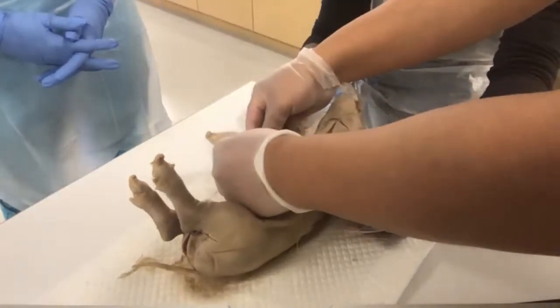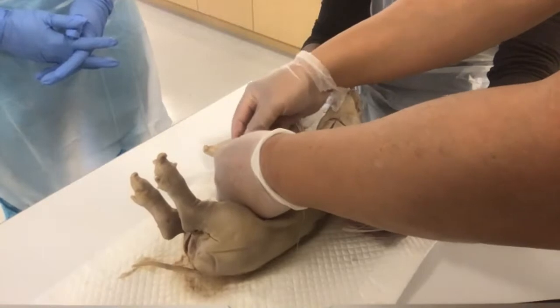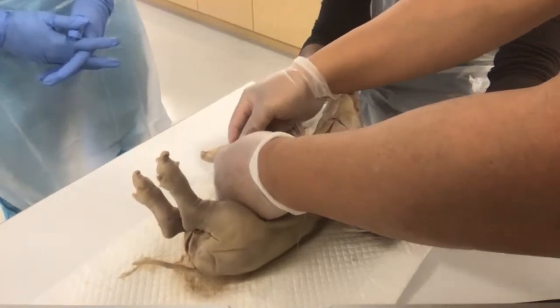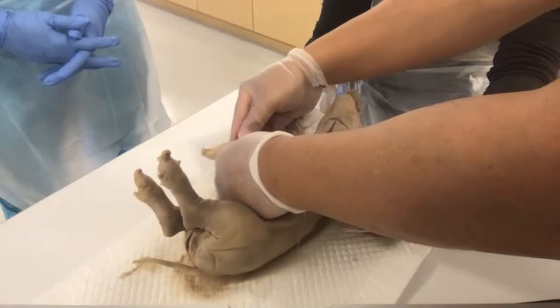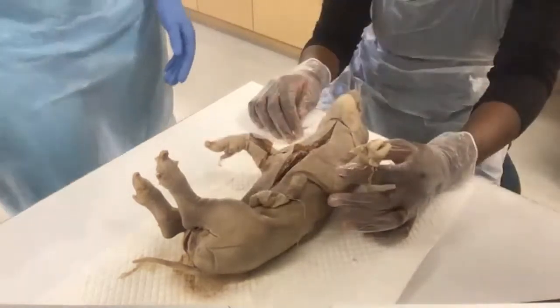So now I want you to take those straight scissors or maybe a scalpel. I want you to open all of this up so you can trace where this muscle ends up and how it connects to the bone. So, surgeon, kindly.